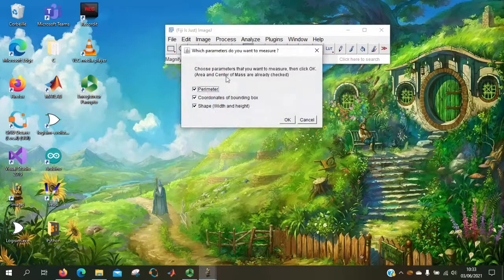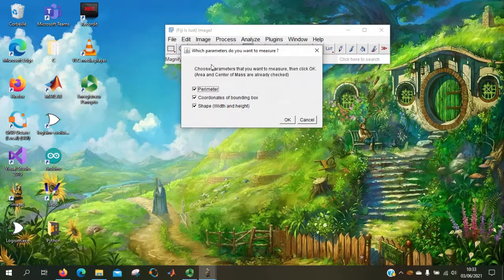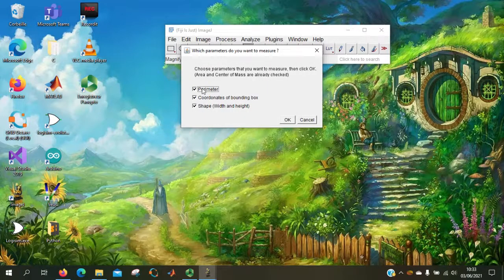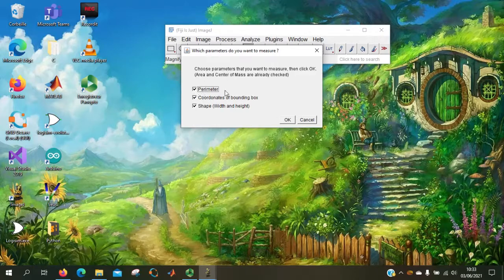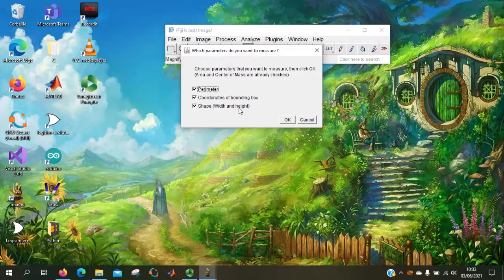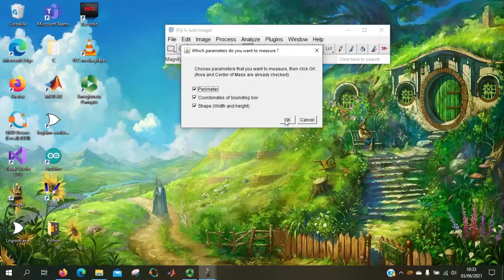Here it asks the user if he wants to get the parameter, coordinate of the bounding box and the shape of the seed. So we can let it be checked.